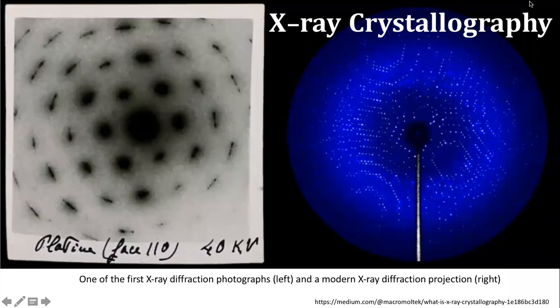Good day, everyone. In this session, we will discuss X-ray crystallography, the technique which has helped us understand what a crystal looks like, the atomic or molecular nature of the crystal, the nature of chemical bonds within a crystal, and how exactly the structure of molecules can be deduced by looking at the specific patterns that they make when they interact with waves or rays like X-rays.